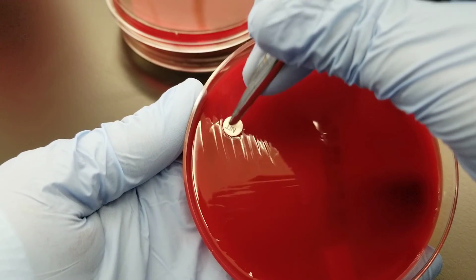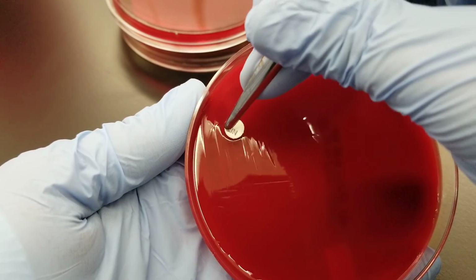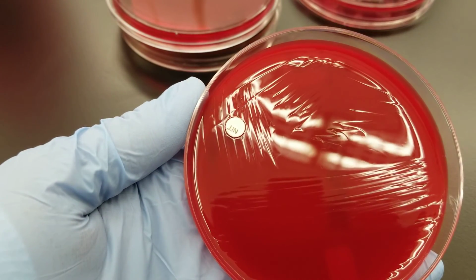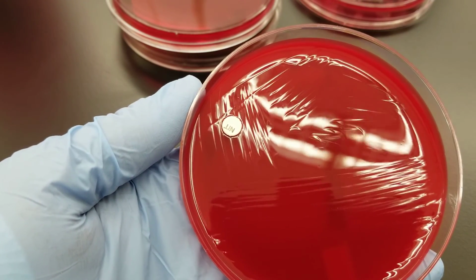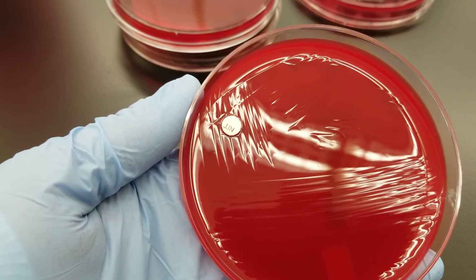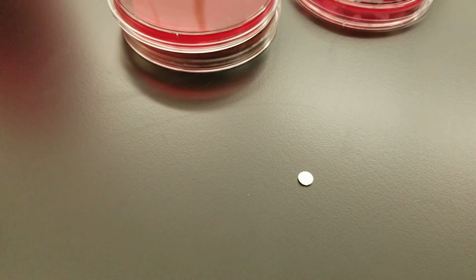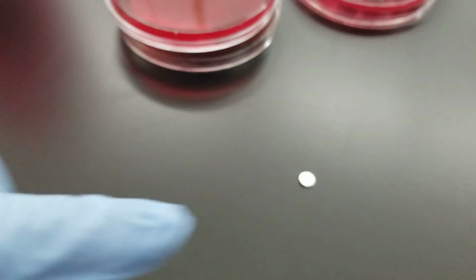So there's my second quadrant, making sure it's nicely placed on there so that it's well seated and it's being touched by the agar all around its surface, okay? And so there's that one. I'll clean this one up in a minute.